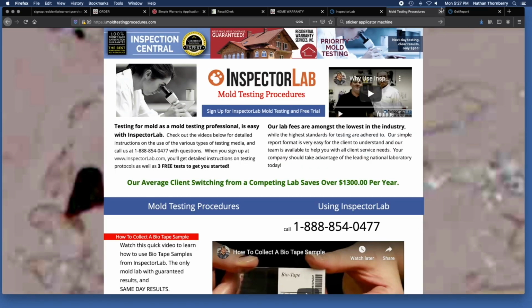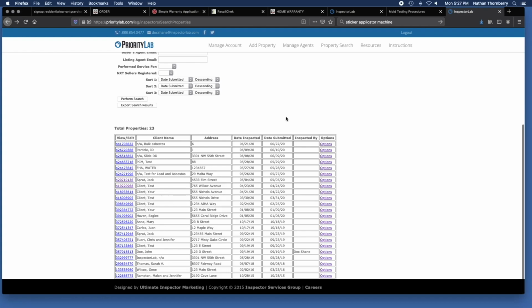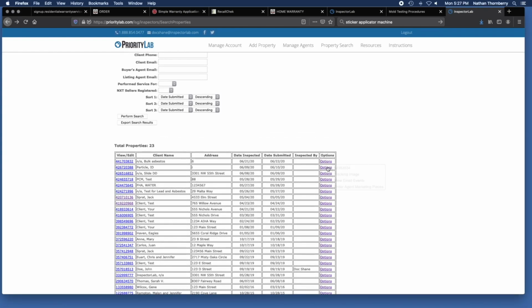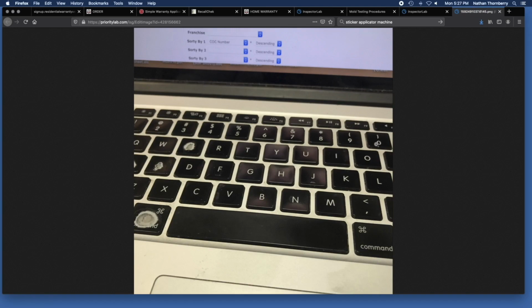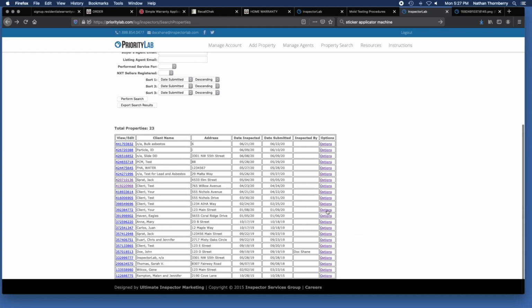Now I'm going to go back to this page here with all of these properties. So you can see every property that you've ever submitted. You can play with these options. You can see the tracking image, for instance. Here's one, and it'll pull up. This tracking image is not the label, but if you were to take a picture of the tracking label in the app, it would show up here, and you would be able to see it. That is basically what this is meant to demonstrate.